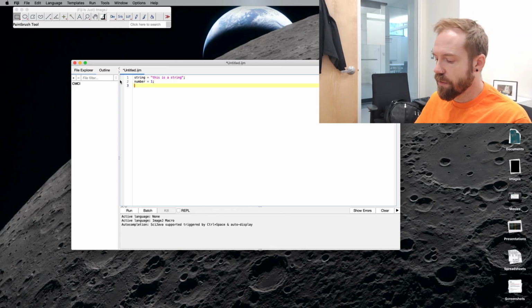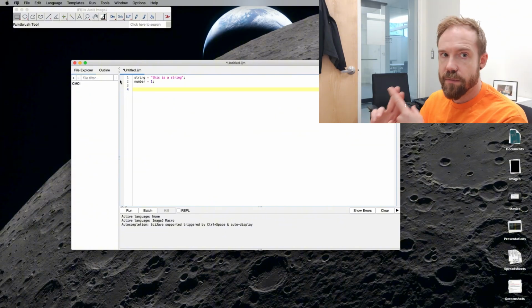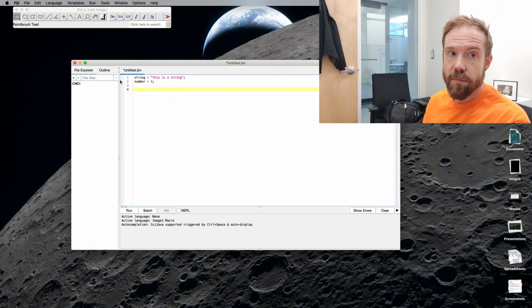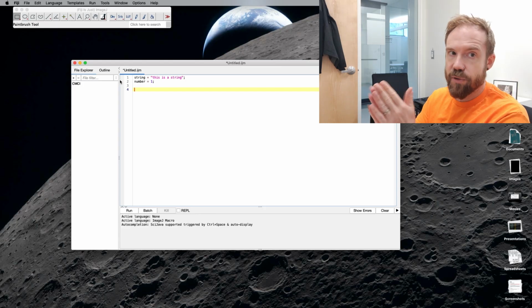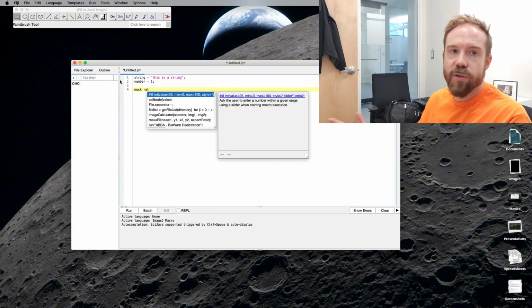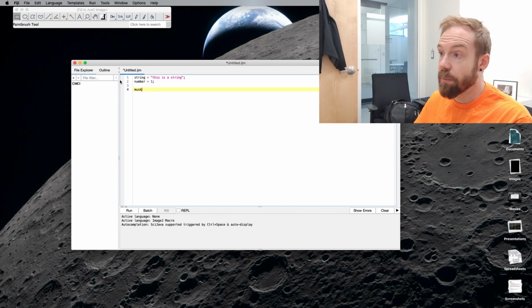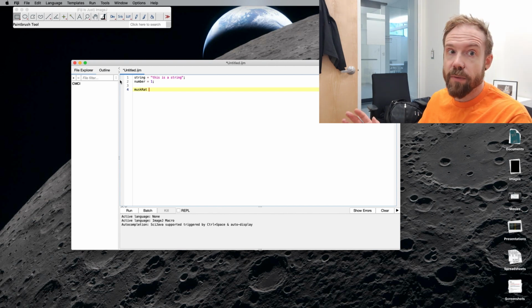When you are making your variable names, as long as you don't use spaces, you're good, because spaces delineate two separate words. So if I have a variable called musk rat, that's two different variables called musk and rat. But if I have a variable called muskrat, that's one variable.